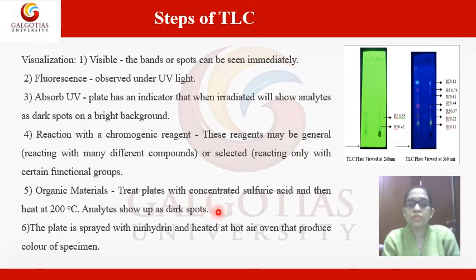Then for some compounds like amino acids, ninhydrin spray is required. After ninhydrin spray, the plate will be dried or heated in a hot air oven, and then the separated compounds will be identified from their color.